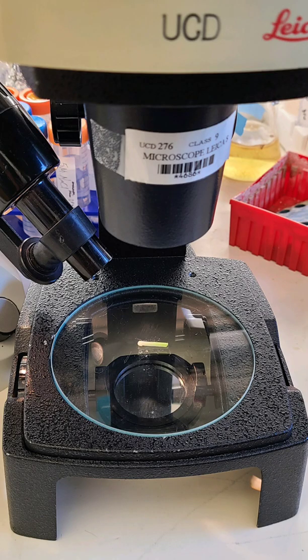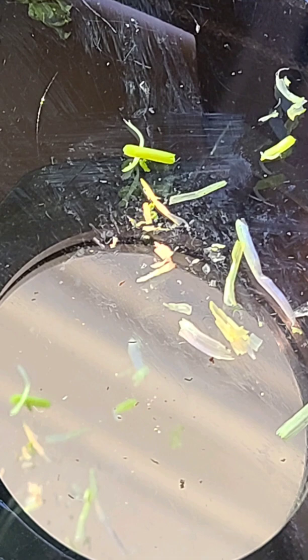Now, the first step is to find the node, which you can see here is this tiny bit that was actually under the soil. You go to the very bottom of the first tiller and you cut that, and from there you start taking it apart using those tweezers right under the microscope.